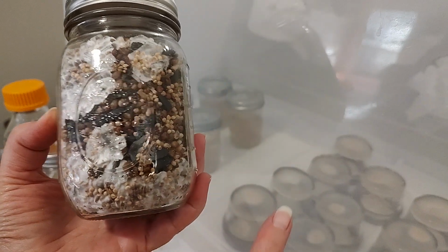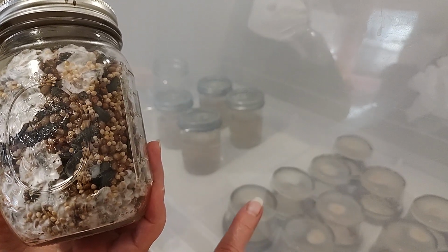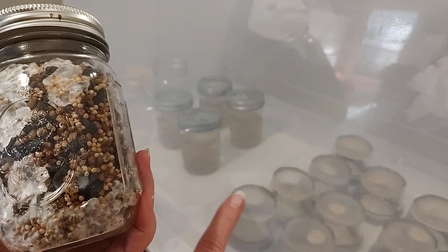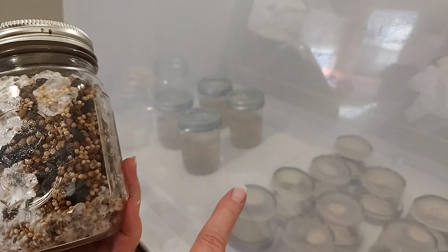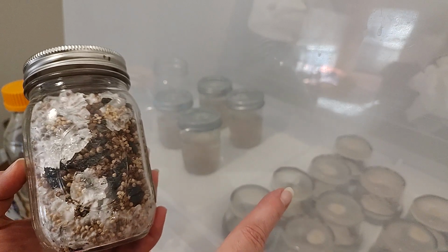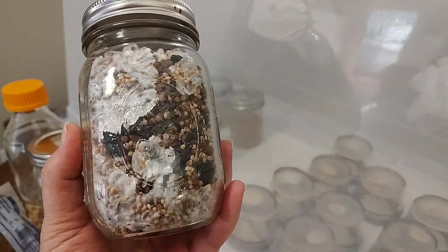And when we have really beautiful plates and dishes, we use no pour jars here. We started with petri dishes and now we use no pour jars. You use these no pour jars to make your liquid cultures and your slurries by transferring your clones or your spores that you've grown out. And a lot of times we have beautiful plates, beautiful dishes, no pour jars, and we have so much left over once we've transferred them that a lot of times I will put this agar straight to the bird seed. So that's what I did. The plates were so beautiful, I didn't want to waste them, so I put them to bird seed.